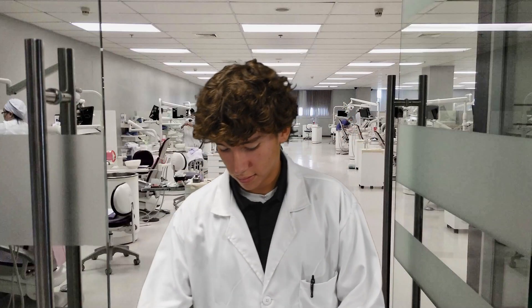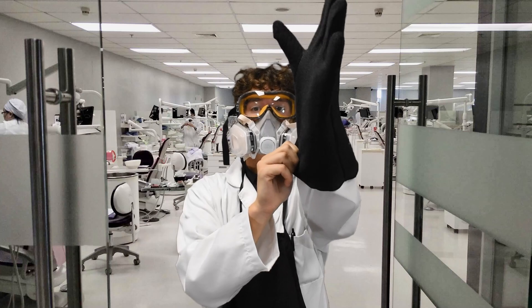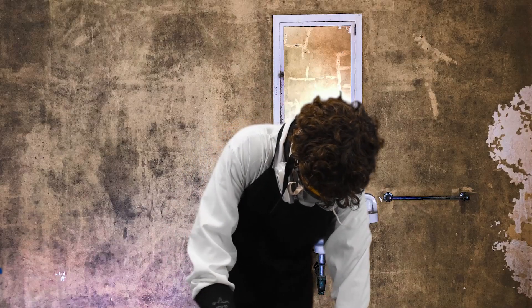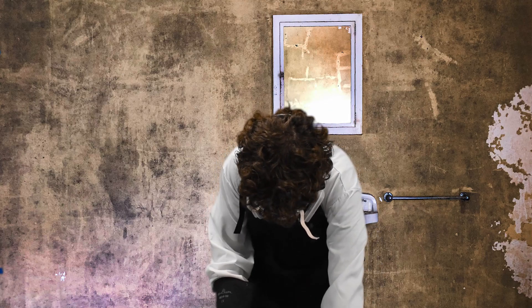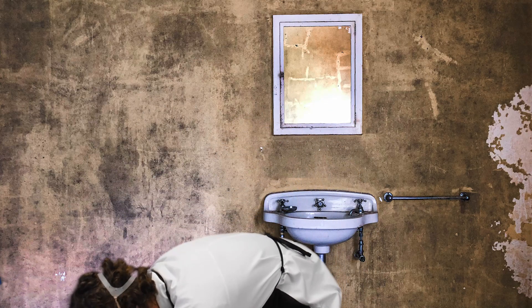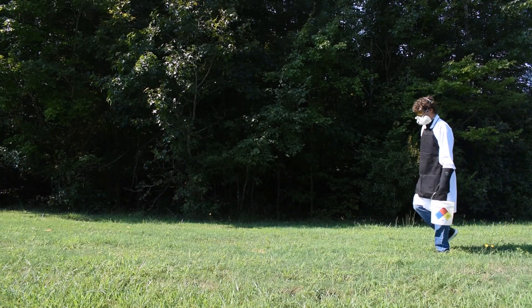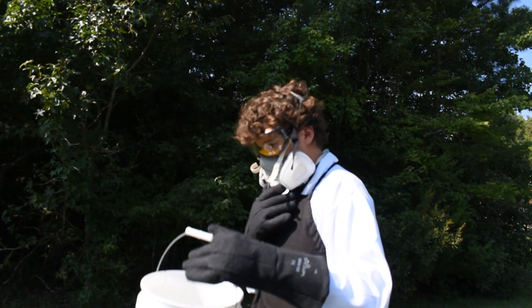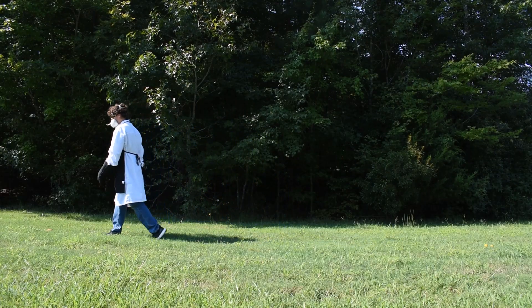Dirty glassware got you down? Relying on solvents to get the job done? Proper disposal is the law, but who cares how much it's costing you? We do.